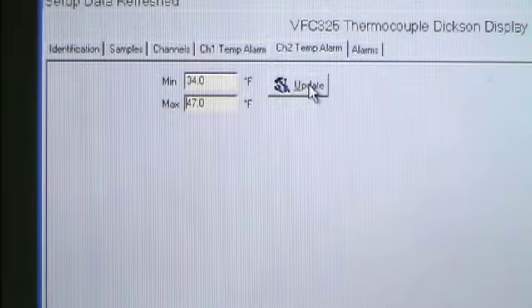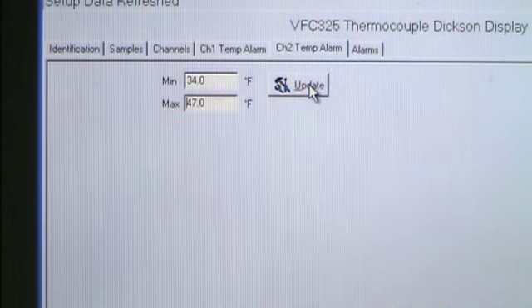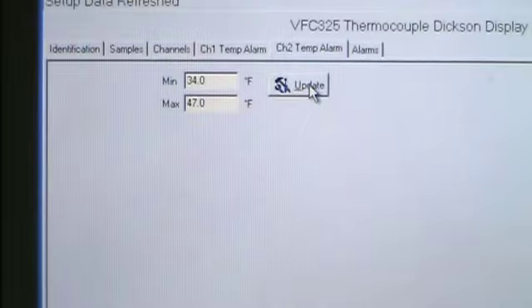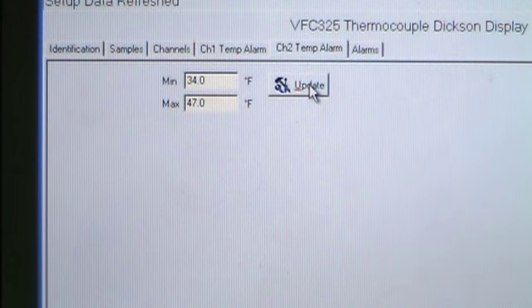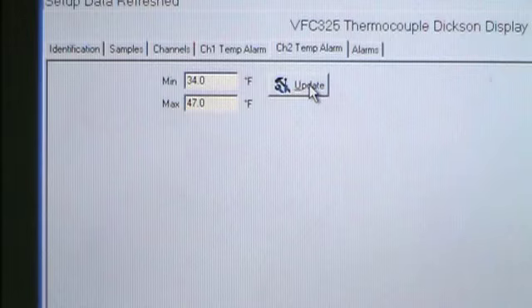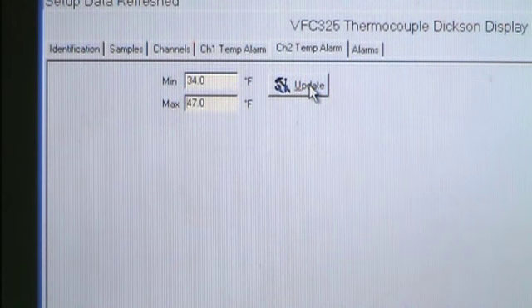Caution: the preset alarm temperatures that you are setting are lower than the ambient air temperature. Therefore, when the alarms are enabled, they will sound. To silence the audible alarm, press the alarm button on the front of the unit. To disable the visual alarm, press the alarm button until CLR appears on the display. ALRN will continue to display until the logger and probes have been positioned in the refrigerator and/or freezer.